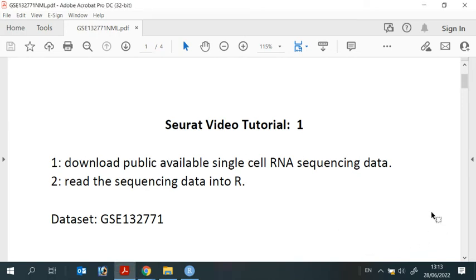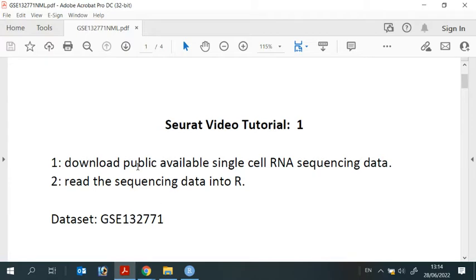Hi, everyone. Welcome to my first Seurat video tutorial. In this video, I'm going to show you how to download publicly available single cell RNA sequencing data and read the sequencing data into R.